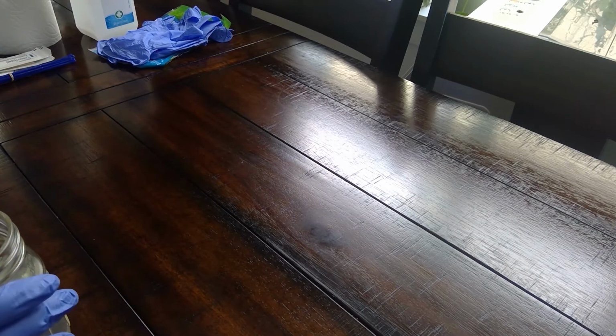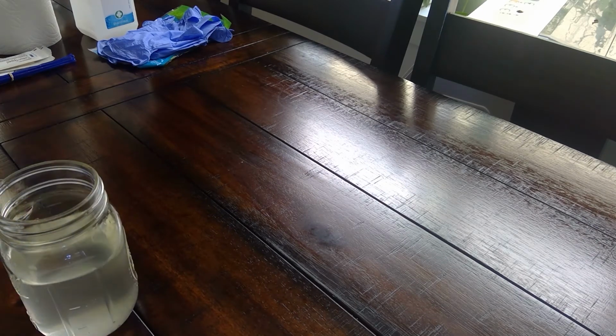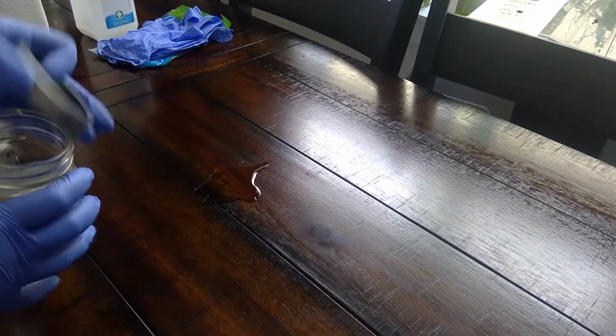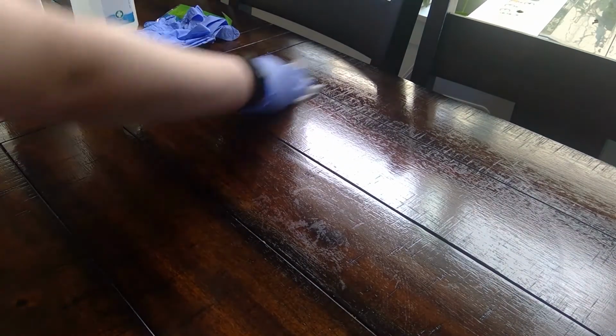And you'll want to make the 10% bleach solution, and it says to prepare a 10% bleach solution, add 1 part bleach to 9 parts water. For example, add a ½ cup of bleach to 4½ cups of water. I did 30 mils of bleach and then filled it to the 300 ml line. So I'll just pour a bit out, cover this, and then wipe down my work area. You'll want to allow that to dry.